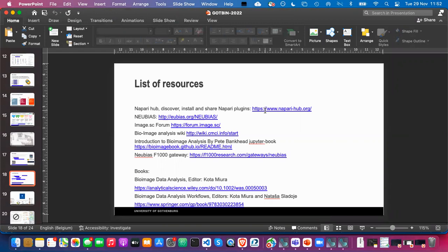What that's going to allow you to do is to use a lot of image to image transformations. So a lot of filtering steps, a lot of these things you can do directly in the viewer. But also there's a lot of very exciting stuff where, because Python is behind and pandas is behind, you can even start doing some clustering and data processing of the output tables, everything within Napari, okay, which would be very, very difficult to manage in Fiji.